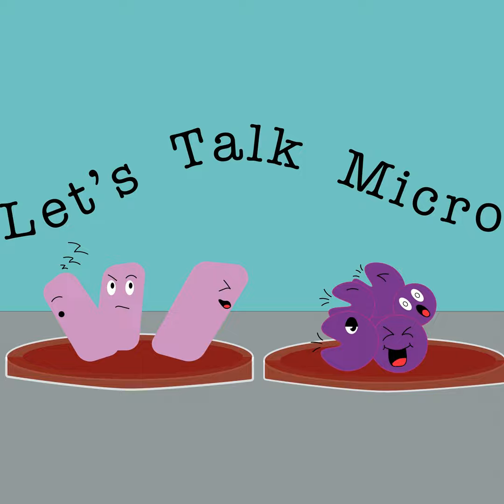And I had them also identify a protozoan, and they had to show me that. Some of them took videos, some of them took still pictures, and they had to point that out with me. So the one-on-one Zoom meetings really worked very well with that. That would have been something that I would have done in the classroom with them, check their stains, check their slides with them one-on-one. And I was still able to do it through remote teaching. Okay, so they got to get that practice with the staining, and at the same time, it was safe for them to use.